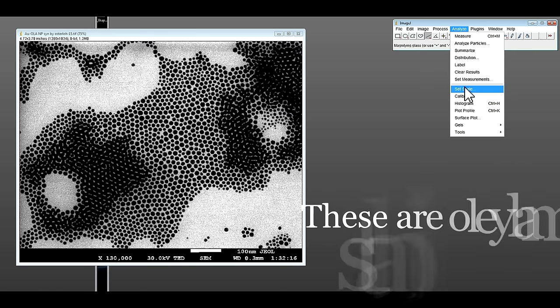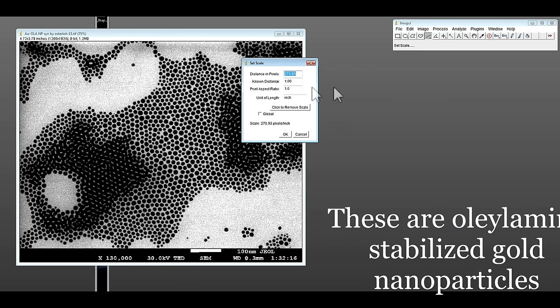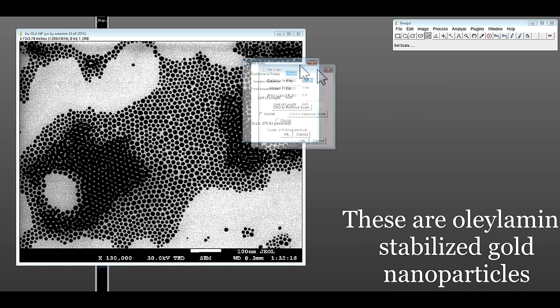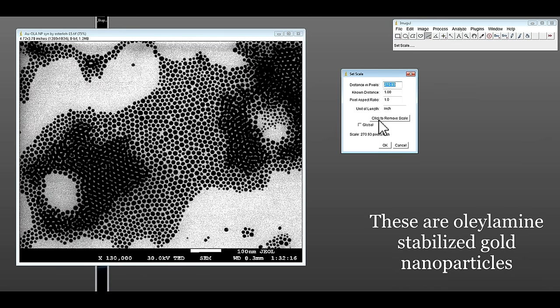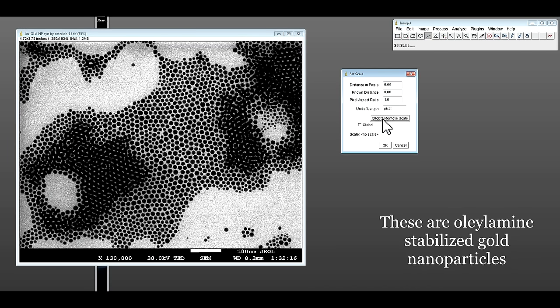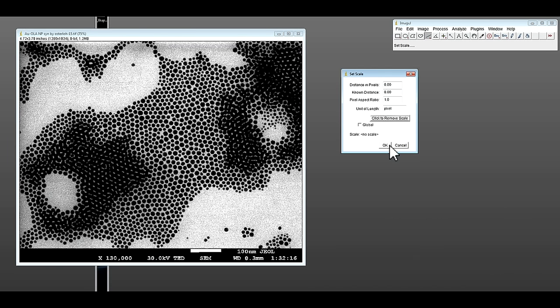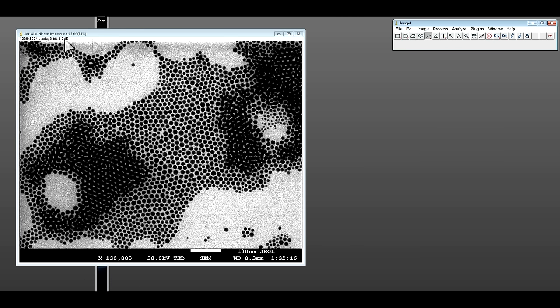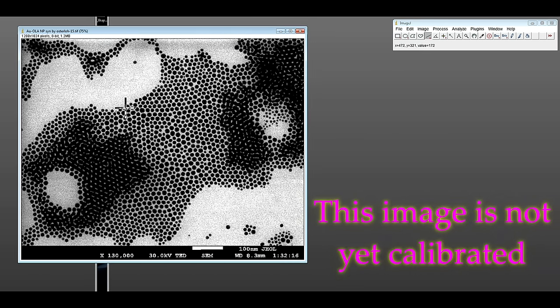First, remove the existing scale by clicking 'click to remove scale' and you can see pixel. Notice here the dimension of this image is 1280 by 1024 pixels and it hasn't been calibrated yet.